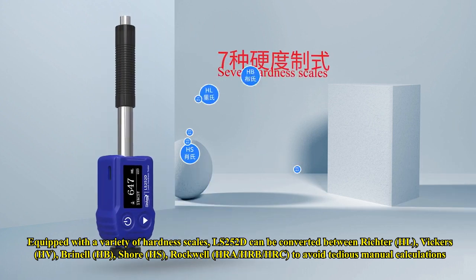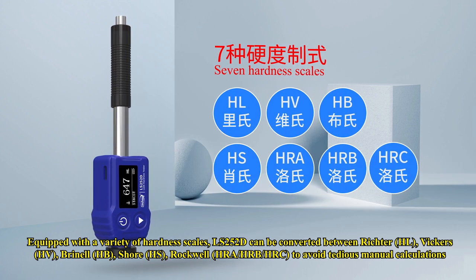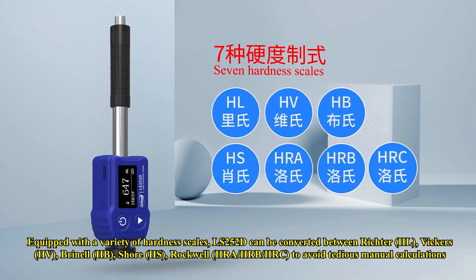Equipped with a variety of hardness scales, the LS252D can convert between Leeb, Vickers, Brinell, Shore, and Rockwell, to avoid tedious manual calculations.